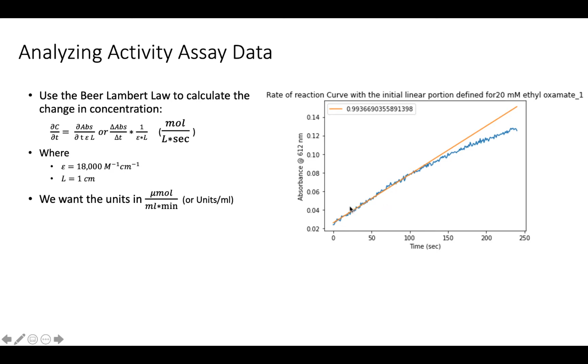If you are taking the slope directly off the trend line, another important consideration is to make sure you get enough significant figures. A lot of times the slope is very, very small, and what the trend line will give you is only 1 significant figure. This has too many on here. I would use the first 3 or 4, but you want at least 3 significant figures in order to carry that forward to do your actual analysis with.